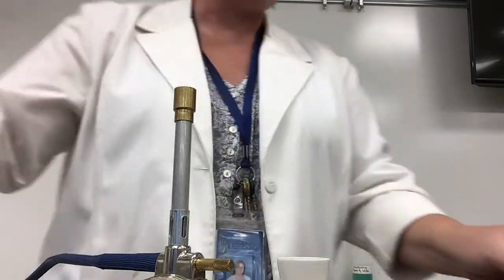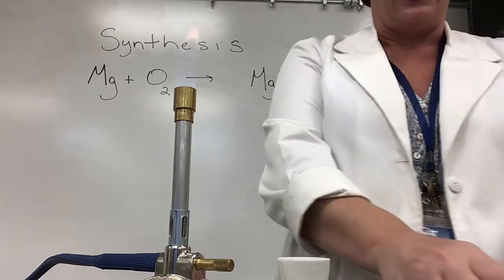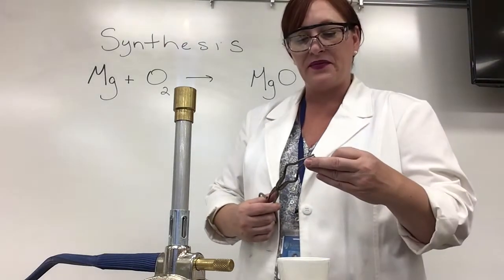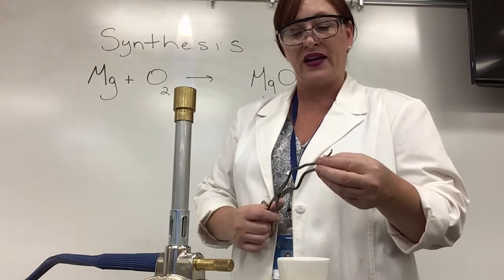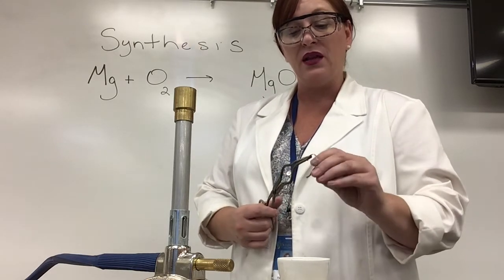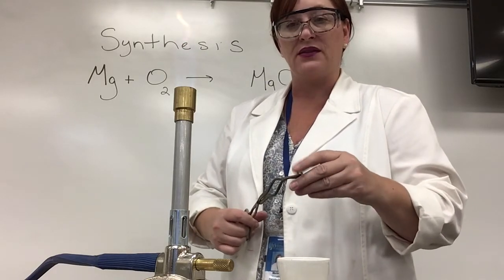So let's turn on our burner and we're gonna hold our magnesium into the flame. It's actually gonna flash kind of a bright white color and I don't want to look at it. So it's gonna kind of give me spots.